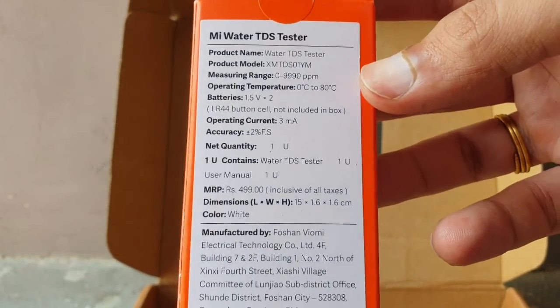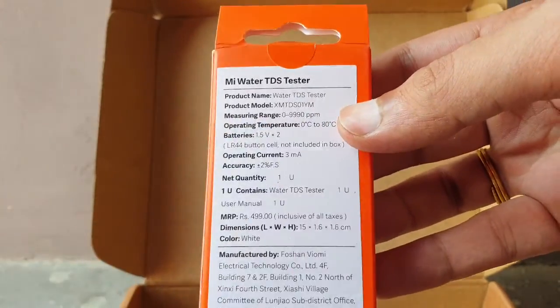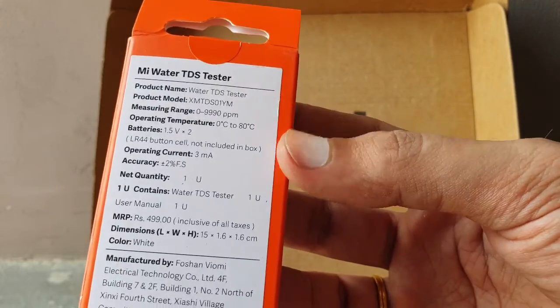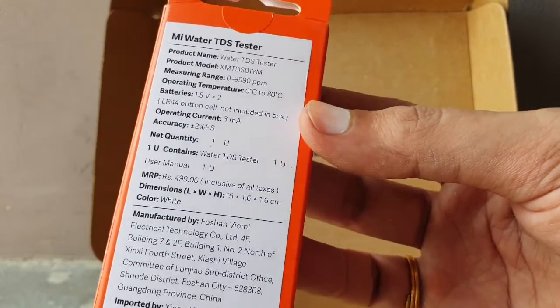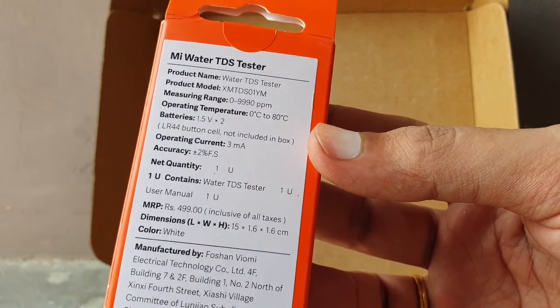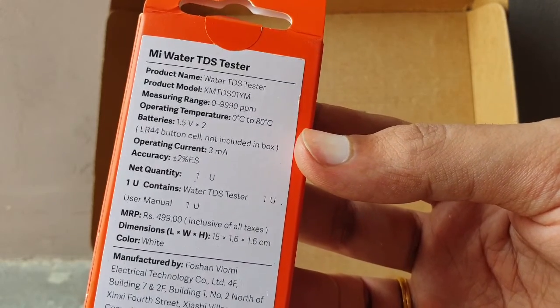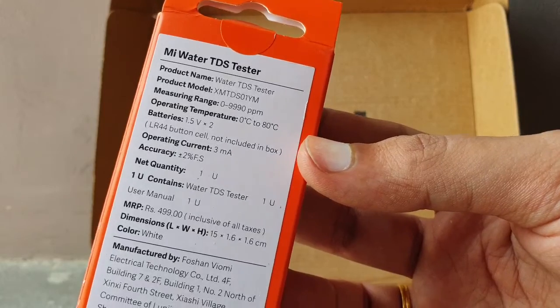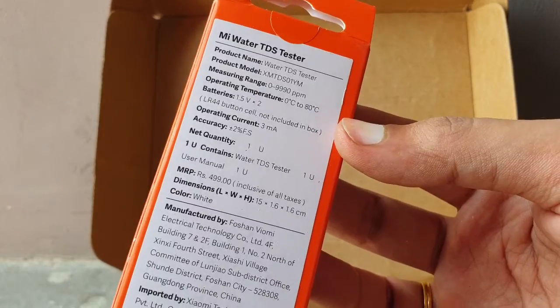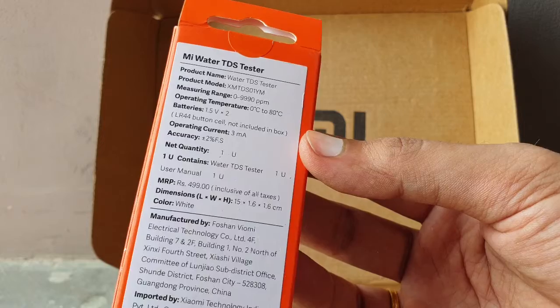The device measures the TDS range of water. Very low TDS — don't drink the water; too high TDS — don't drink the water either. It should be in a good average range. Good water purifiers make water around 100 to 300 ppm, which is safe for drinking. Don't go below 100 and don't go above 300–500, as that is very hard water.